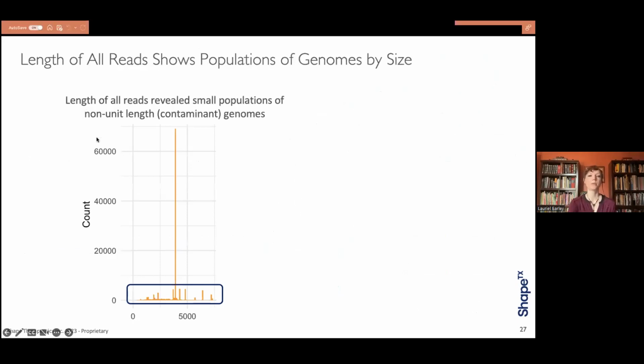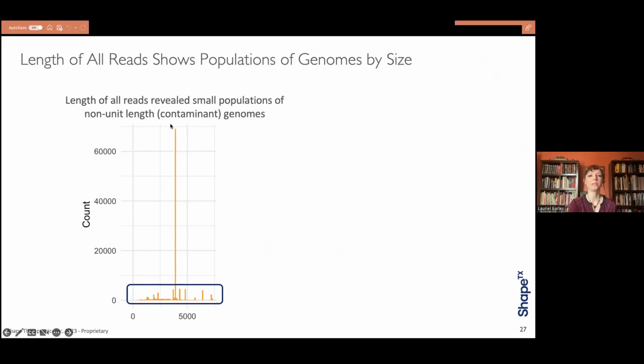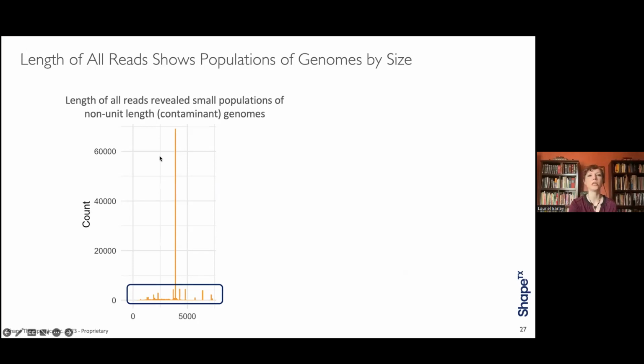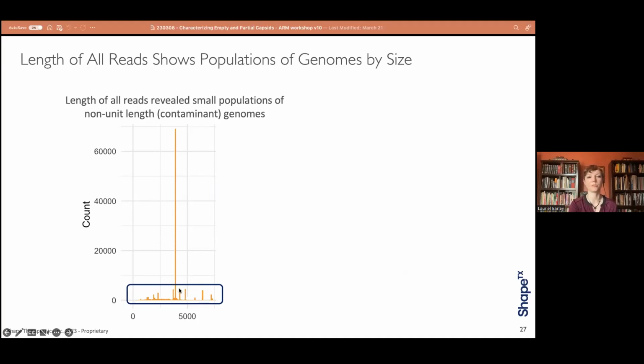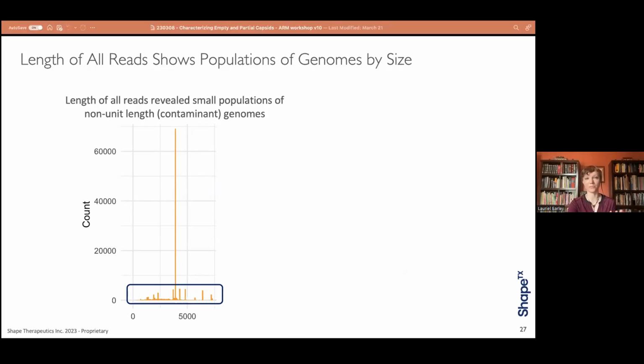When we plot things by read length, we're taking each individual genome and putting it on a plot here by count. We can see that our payload matching genomes of that length are the highest of those species. But there are a lot of these non-unit length contaminant genomes at the bottom of the graph here. These are all things that are not our intended therapeutic product. Well, if it was a therapeutic product; again, this is a CMV GFP.